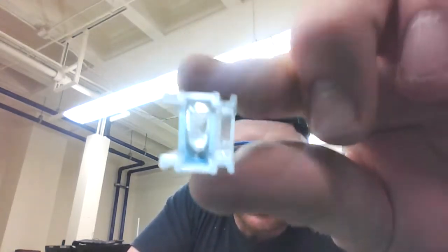So what I will do is add 900 microliters to my cuvette that has at the bottom a label of C and 2. That letter C to me is an indication that I'm using a visible light cuvette. So I'm going to add 900 microliters to this visible light spectrum cuvette, put it into the spectrophotometer, and press read blank. Once that has completed, I will add my 100 microliters of my protein fraction to that 900 microliters, pipette up and down to mix it thoroughly, put it back into the spectrophotometer, and press read sample. I want you to follow that same process every single time.